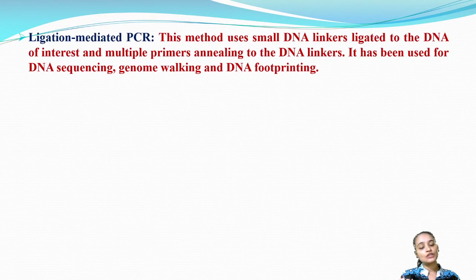What is ligation mediated PCR? This method uses small DNA linkers which are ligated to the DNA of interest, and multiple primers annealing to the DNA linkers. It has been used for DNA sequencing, genome walking and DNA footprinting. That's why it is called ligation mediated PCR.